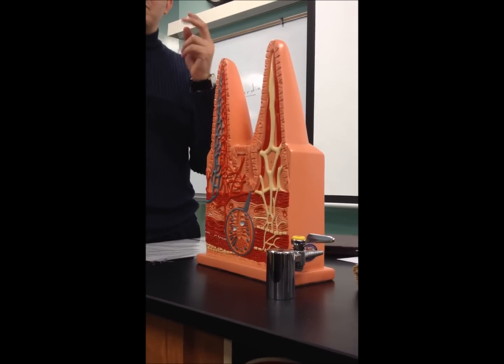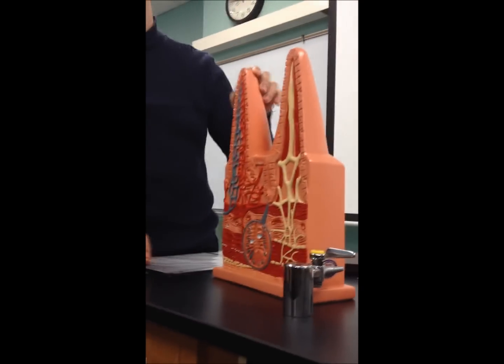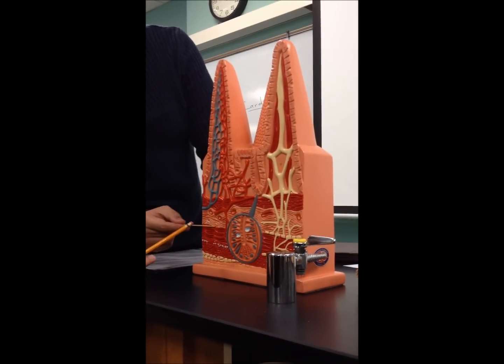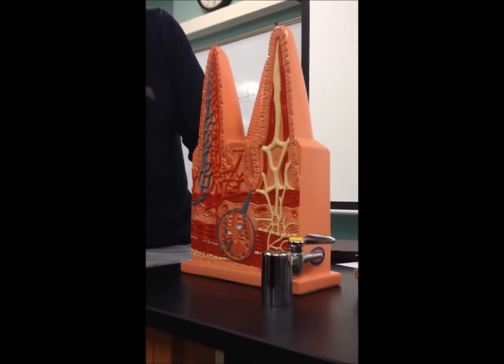And the slide, if you remember, only showed two layers: the mucosa and the submucosa. I remember telling you the model would show more layers. So we have the muscularis externa here, and you have the serosa. Okay, let's understand each layer.